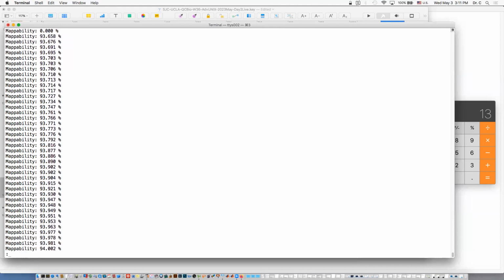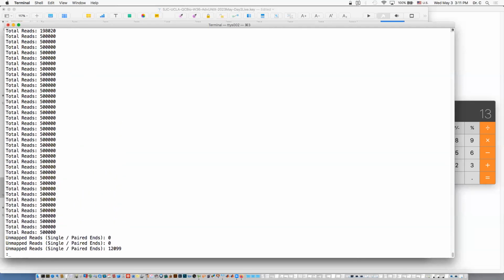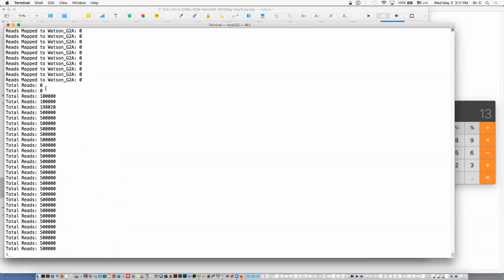And what do you see? Like 94, 93, 93, 93, two of them are 0. That's not good. Total number of reads: most of them are 500,000. We expect there should be 2 of them that are 100,000. 2 of them are 0 and one of them is 198,020. That's not good. And that probably corresponds to the 2 empty BAMs and the partial BAM.